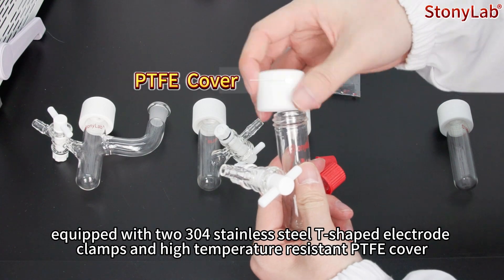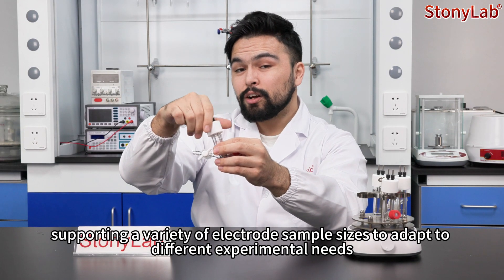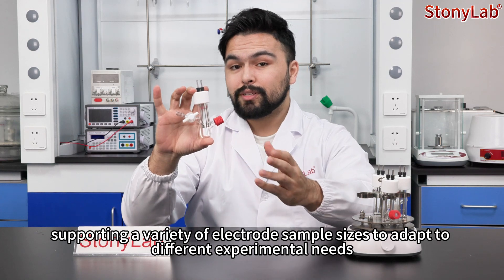It features a high temperature resistant PTFE cover supporting a variety of electrode sample sizes to adapt to different experimental needs.